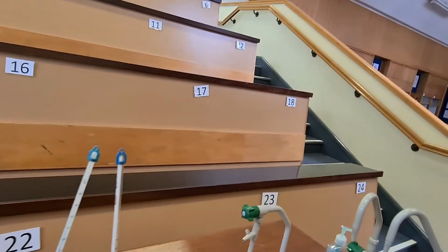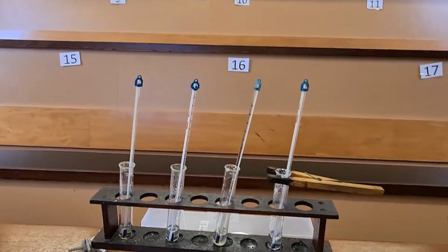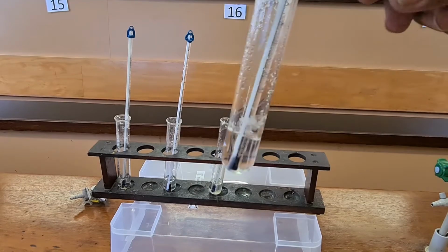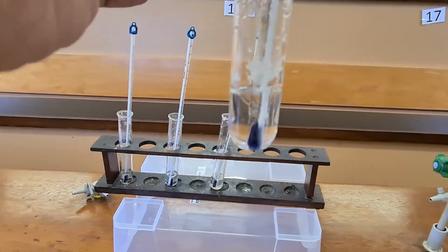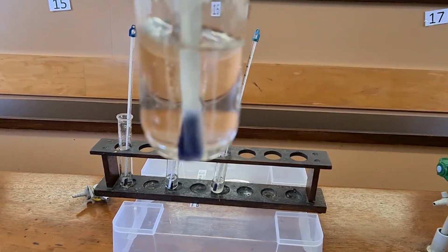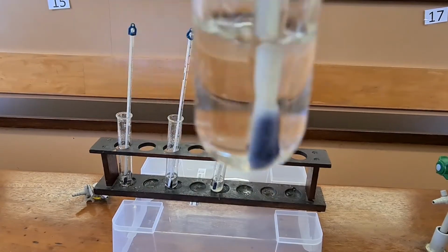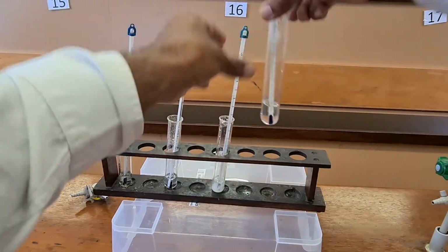There are the 4 test tubes. That last one, test tube D. Can you see we're looking at the solution really? We're looking at the bottom, and there we're going to look to see when we get crystals as it cools down.